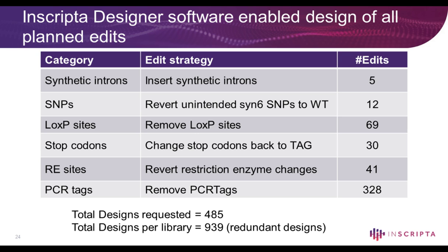This was a great example because it is a mixture of edit type in a single library. While in the previous case, many of those libraries had a single edit type, like a saturation mutagenesis is all substitutions, which you saw in the lysine example. While in this example, we have substitutions, deletions, insertions, etc. in a single library.